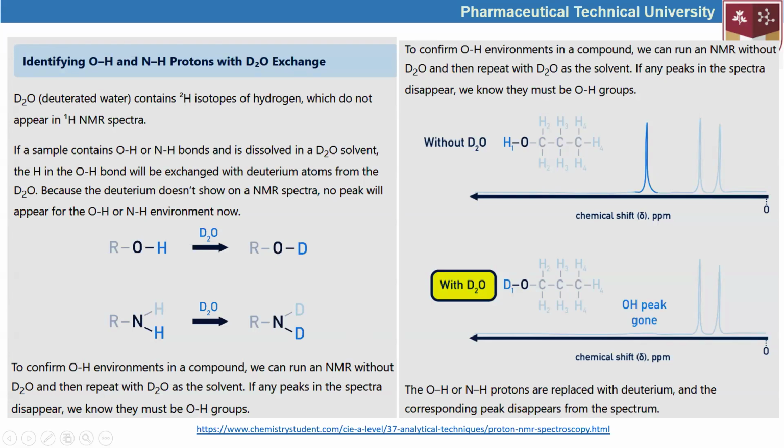Here there is one point we have to pay special attention to: while we are using D2O, we might have an exchange between the OH belonging to alcohols and D2O, which also has its own dissociation, as is observed in normal water. So we might observe the exchange between hydrogen and deuterium, which might cause misinterpretations.